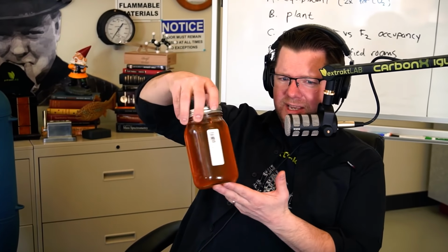One of the things that is very cool about CO2 is that you're able to do a couple of different things. First of all, you're able to run in subcritical mode, which is a very common technique, been done for years, to get out some of the more volatile compounds into a prefraction. And that's a very soupy prefraction of terpenes, essentially. The other thing you can do, like we do pre-processing, and we gather all of our terpenes out ahead of time. For example, this is a jar of basically pure terpenes. Wow.